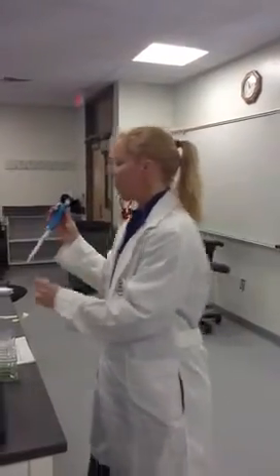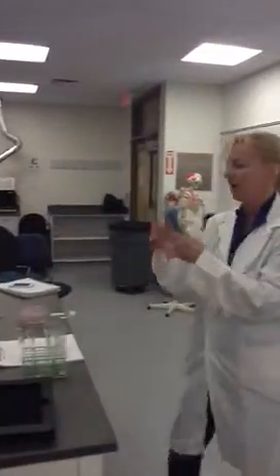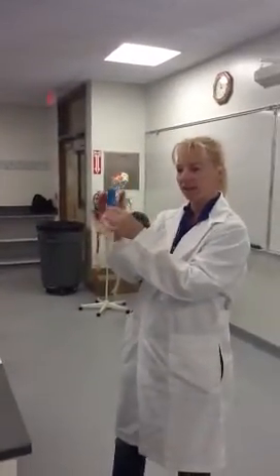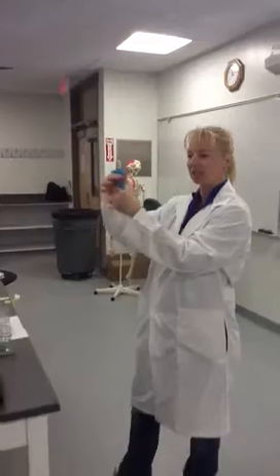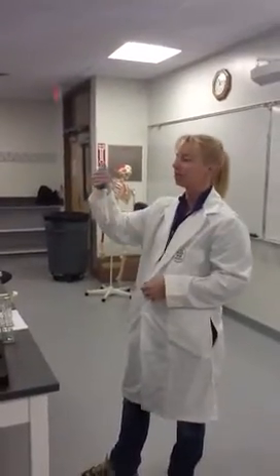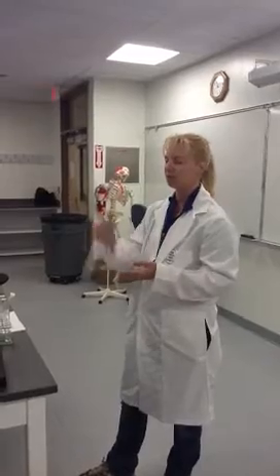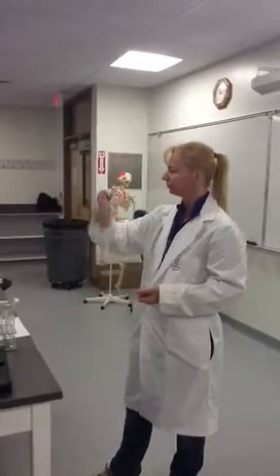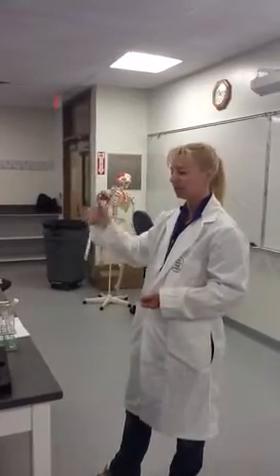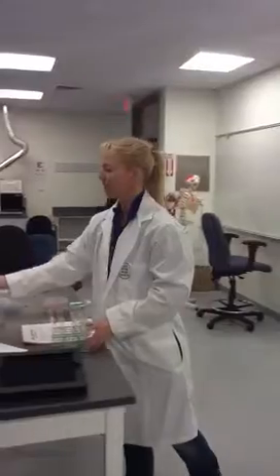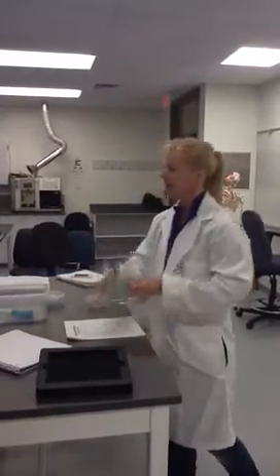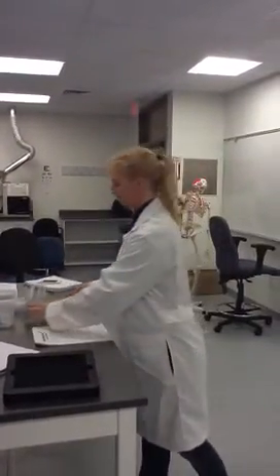There are other types of pipettes out there. Some of them will have dials on the side. Some will be on the top here that adjusts the volume. And then other ones are for a fixed volume. So if you were going to be using one volume to transfer lots of things, the easiest thing is just have one that's a fixed volume. And it's just plunger, pretty easy to use those. So you can play with them to get an idea of what they're like. That's what the test tubes and the water are set up for here.